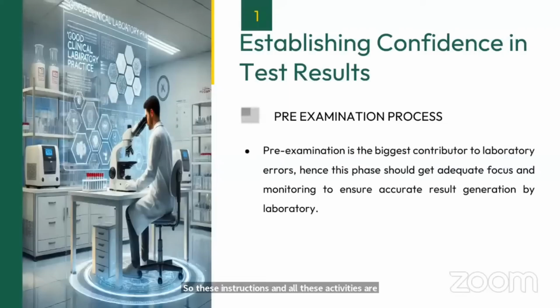So, when we consider a medical laboratory, pre-examination is the biggest contributor to laboratory errors. Hence, this phase should get adequate focus and monitoring to ensure accurate results and generation of the result by the laboratory. As most of you will be aware, there are multiple research papers which have been published, and they claim that around 20 to 70% of the errors in your laboratory are due to pre-examination processes. So we consider pre-examination as the biggest contributor of laboratory errors.